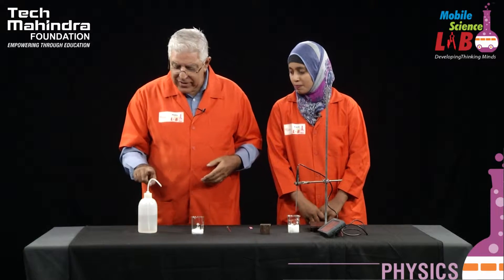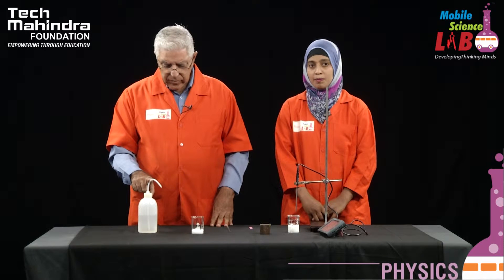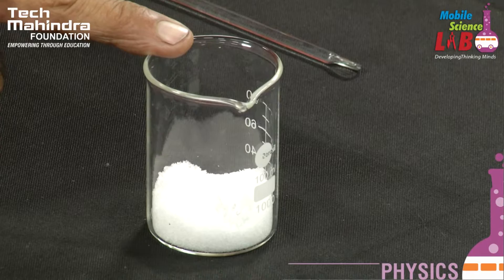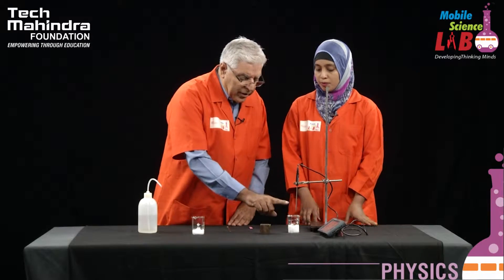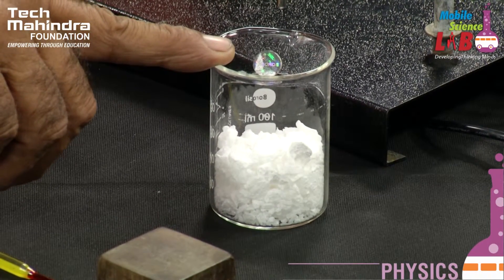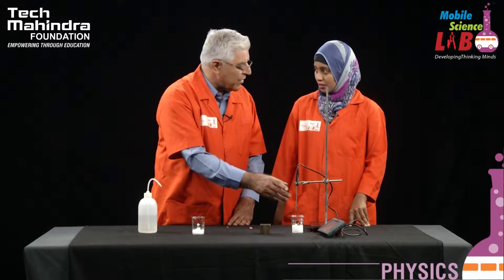To do this experiment we have the following equipment as well as chemicals. Now this is a wash bottle, as all of you know, and it contains water. In this beaker I have a chemical called ammonium thiocyanate. In this beaker I have a chemical called barium hydroxide octahydrate — a very big name, but quite a useful chemical for us. Then we have a very sensitive temperature probe. It is a very sophisticated one.